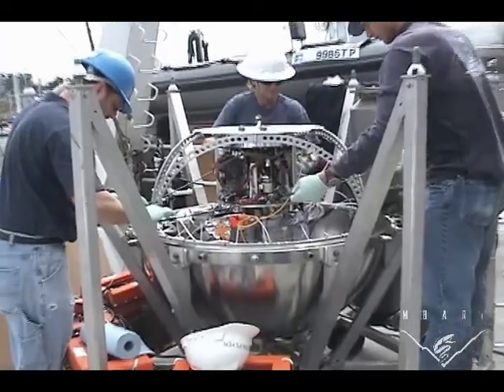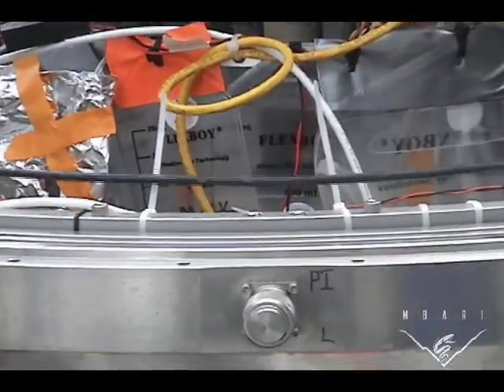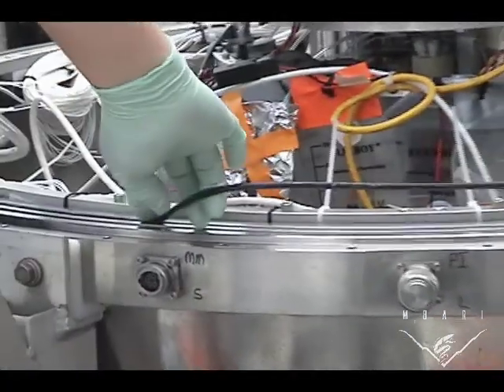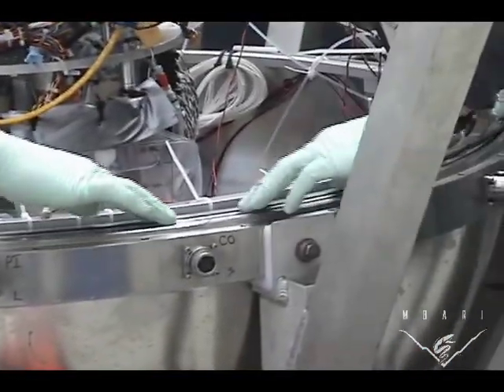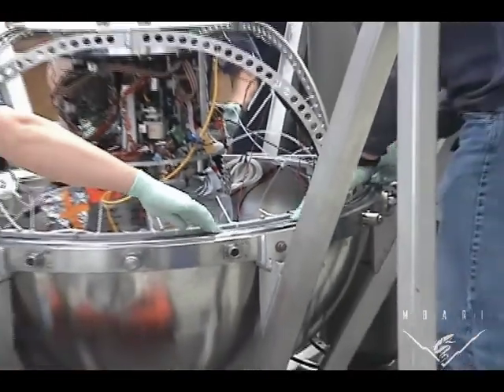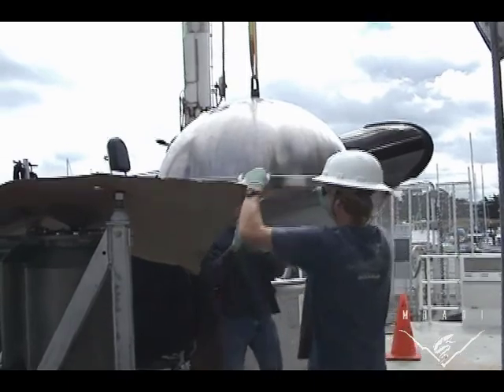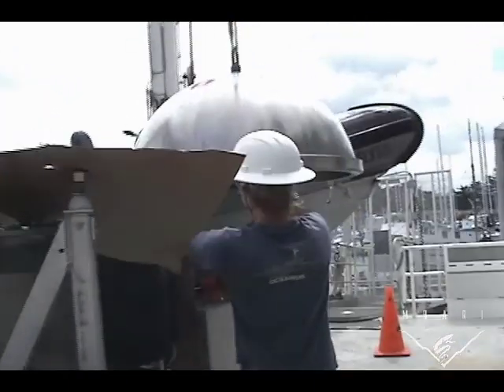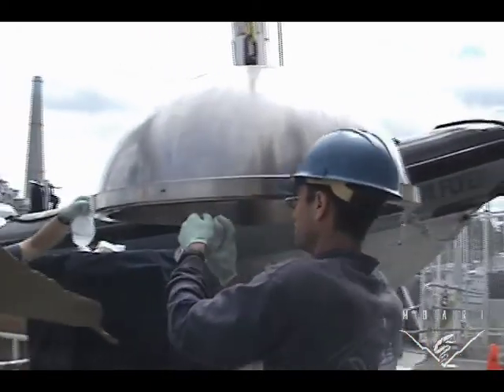We seal the ball with these O-rings — there are two of them. They're placing one of the O-ring in a groove, and there'll be a second one. Then in the next scene you'll see the top of the ball and the face of that being prepared, because we have to have a perfectly flat, clean seal in order to withstand the pressure that this ball is going to experience at depth.